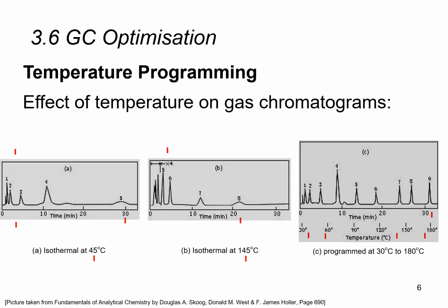It allows us to start with a low temperature to separate the not retained compounds, and at the end it allows us to raise to a high temperature so that we can get all the highly retained compounds out of the column and towards the detector.